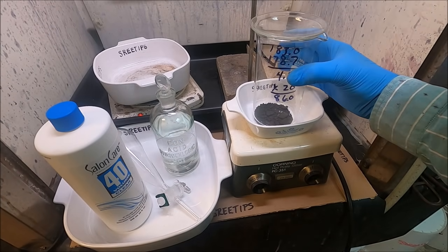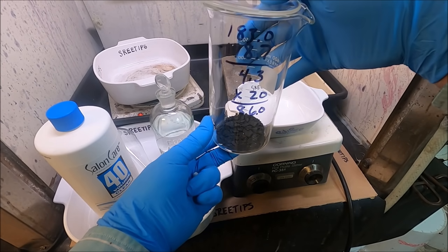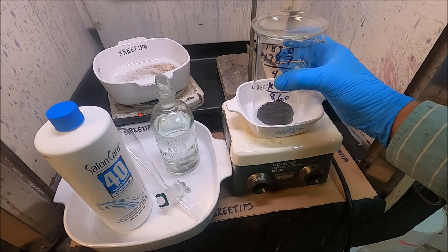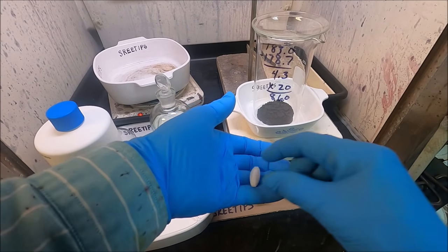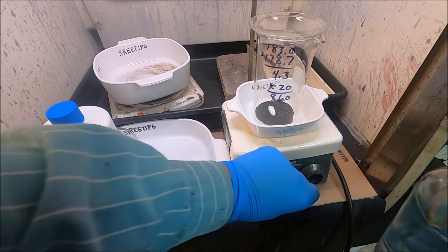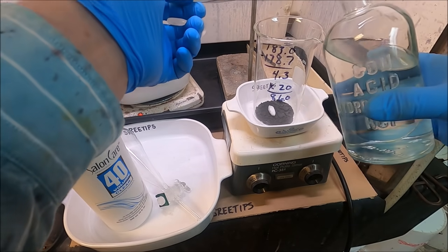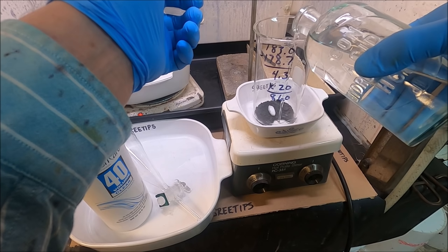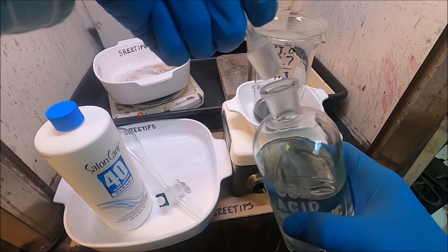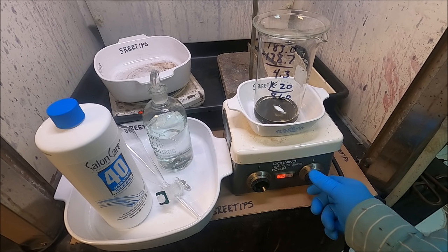We're going to begin by dissolving our 4.3 grams of black PGM powders — this is going to be mostly palladium and platinum. I've got a stir plate set up here with a stir bar, let's drop that in. I'm going to add about 50 milliliters of hydrochloric acid. Start the stir bar and I'm going to start adding some heat now.